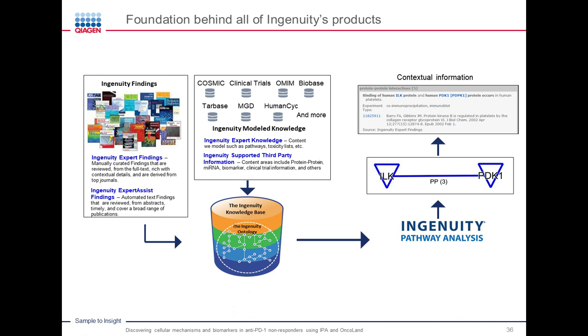This information is coming from this specific publication, and if you click on the hyperlink next to the publication, it will take you to the PubMed page for that publication, so you can dig into it in more detail and see if you want to trust that information or not. But the key here is we have a database where our curators are reading through text and figures of the paper and manually curating a lot of the information, and that's why it is of such great quality.